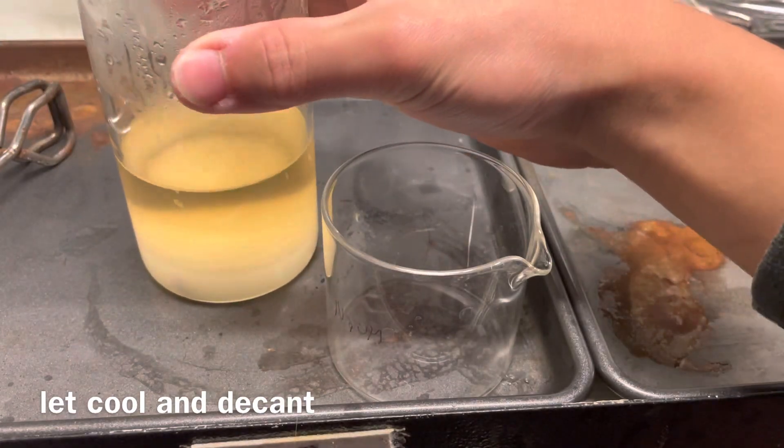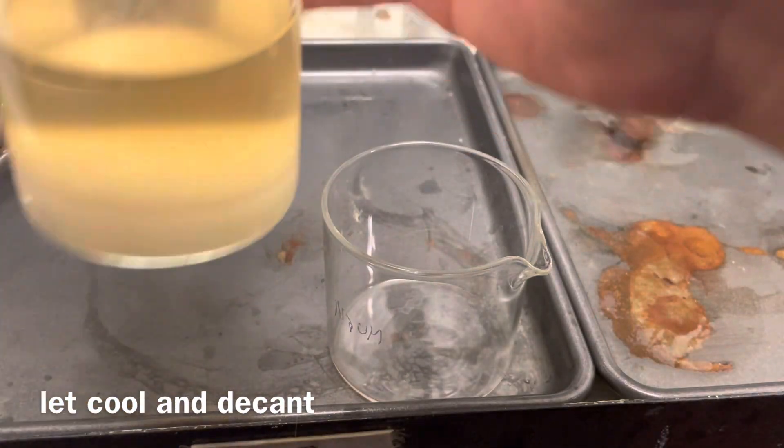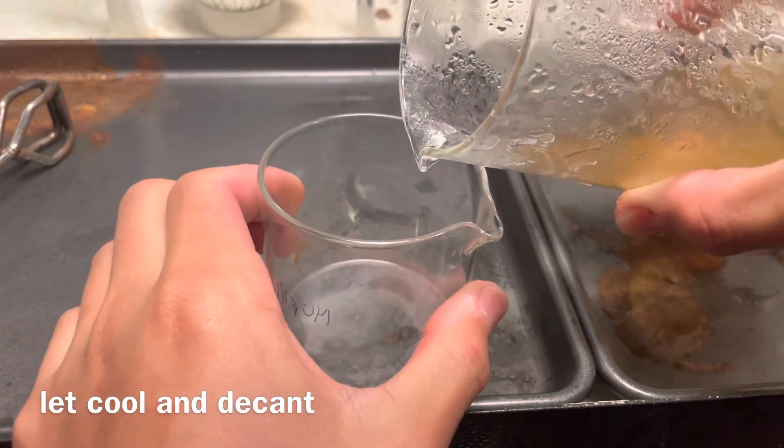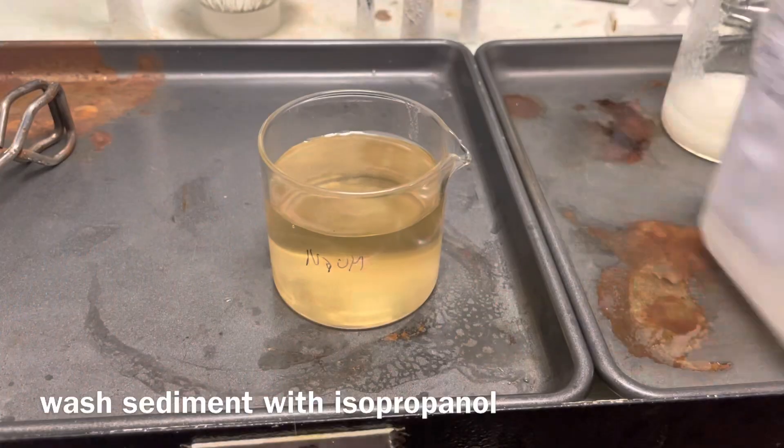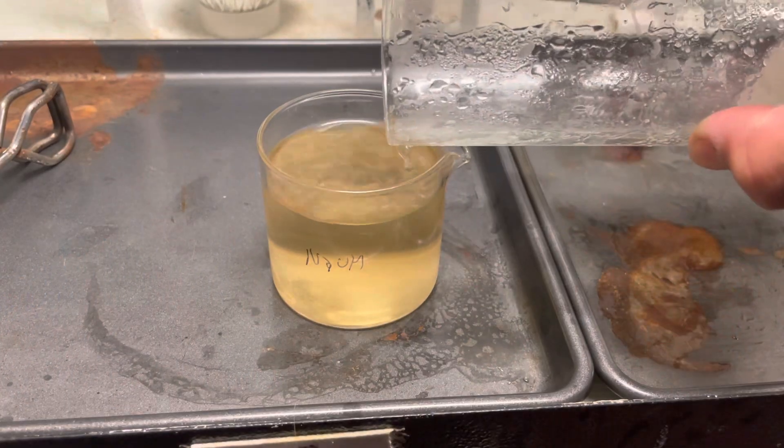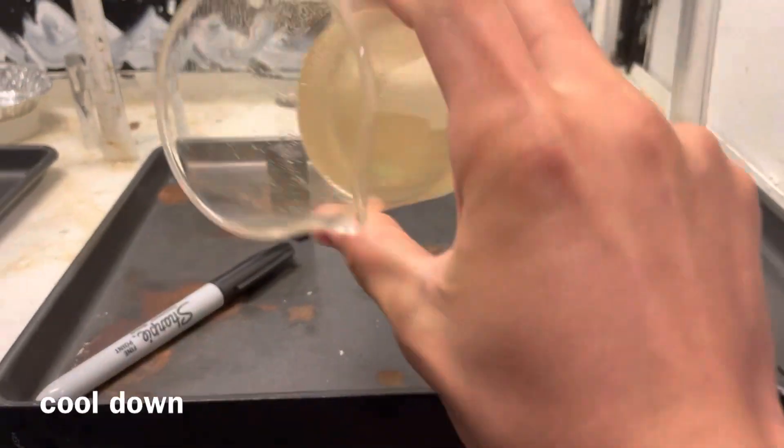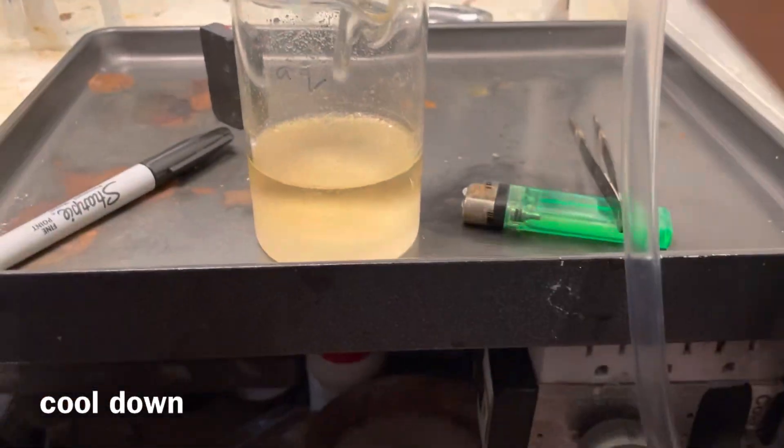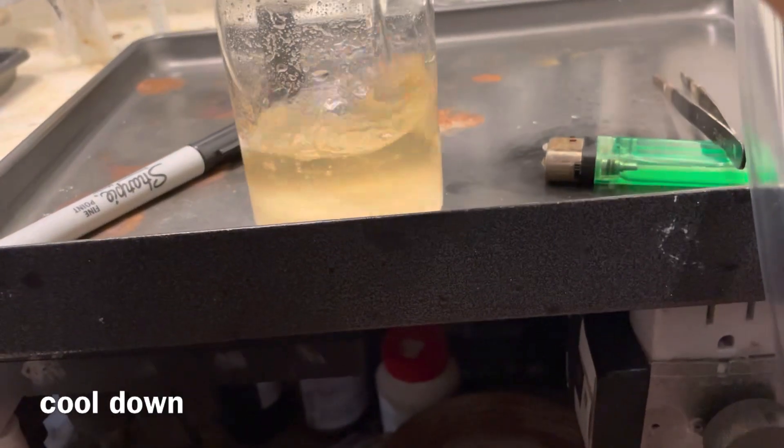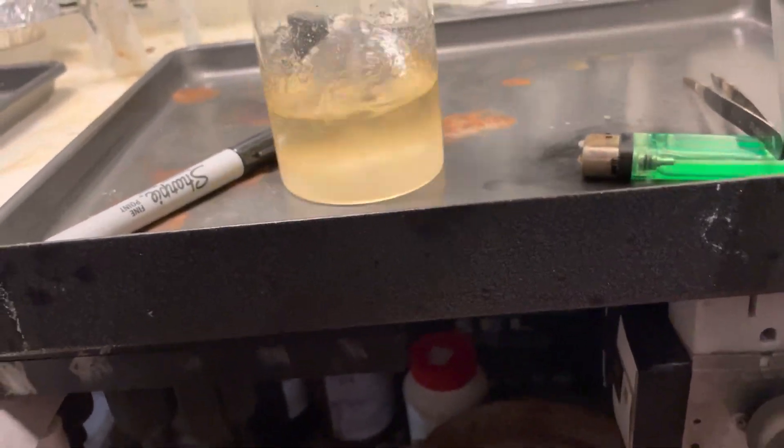Cool this down to room temperature, and now decant your solution from the sediment. The sediment, again, sodium sulfate, and also some other stuff. Wash it with a little bit of isopropanol, and then acidify the whole thing and boil it down. And then cool it down again. And here you can see the sodium sulfate has precipitated out.